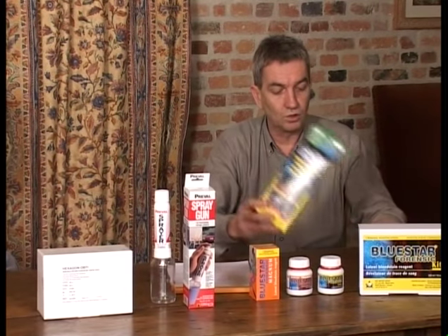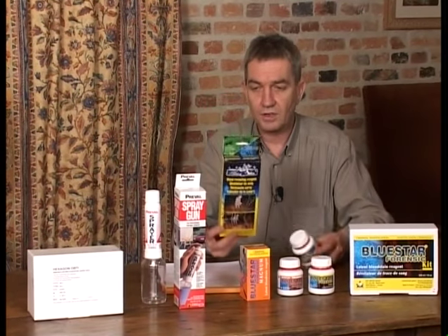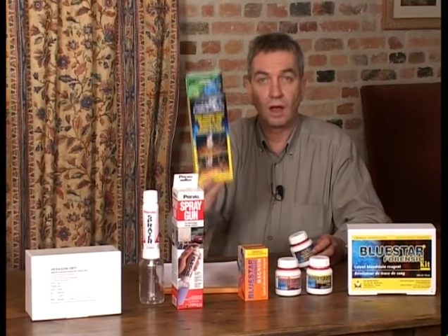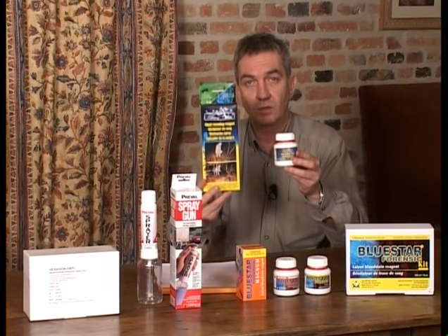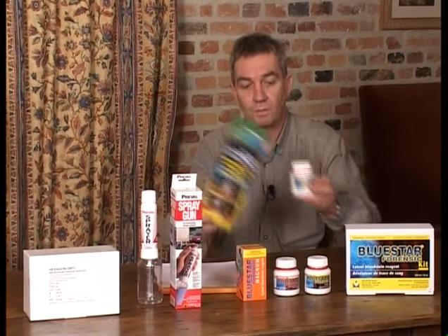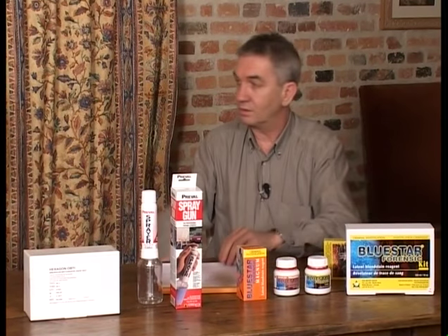I must finish by showing you two other products that you can find in stores. That product there and this one here should not be used at crime scenes. They are Bluestar products intended solely for hunters.